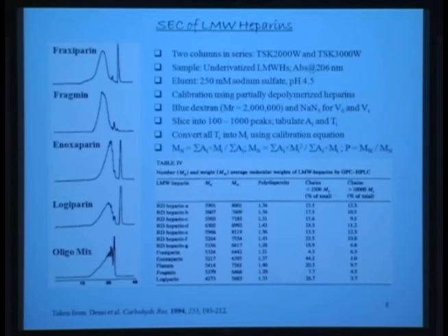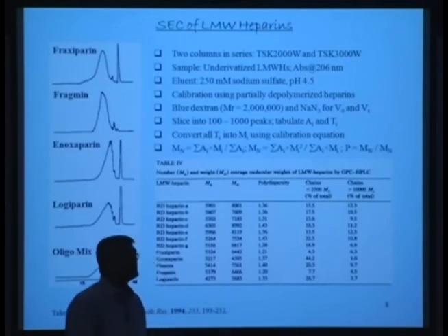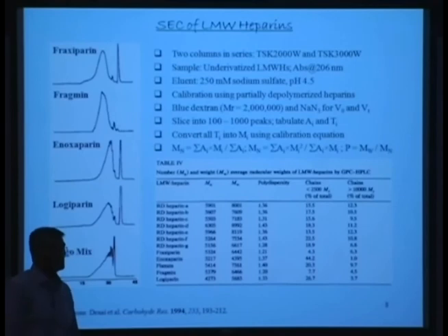Yeah, go ahead. So have you seen many, or I guess, is it common to use light scattering to measure polydispersity? You can use light scattering to measure polydispersity. The only difference is that the particles have to be significantly large in order to scatter light. Okay? So yeah, absolutely. Polymers is okay, but not oligomers. Yeah, oligomers you won't be able to see anything.